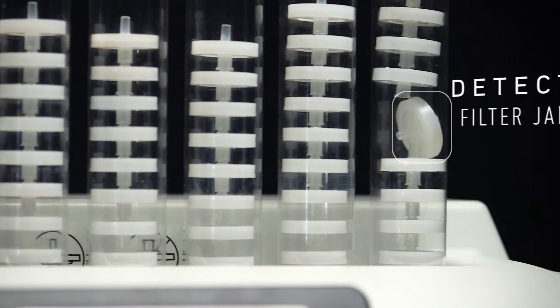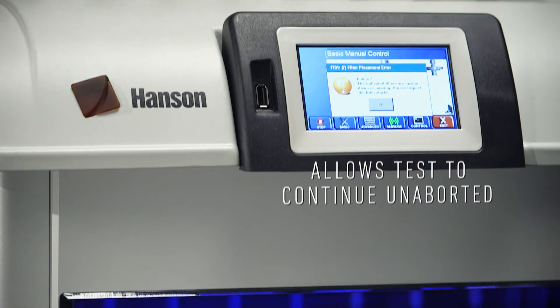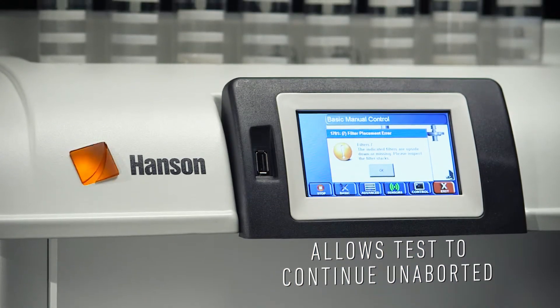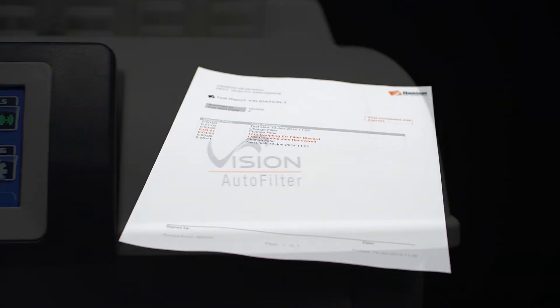Our intelligent sensing design detects filter jams and, if necessary, collects unfiltered samples so the test is not interrupted. Allowing a test to continue unaborted will save valuable time and money. On-screen notifications and post-test reporting will identify any unfiltered samples.